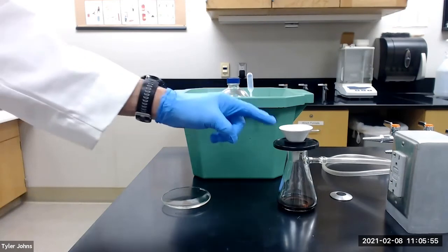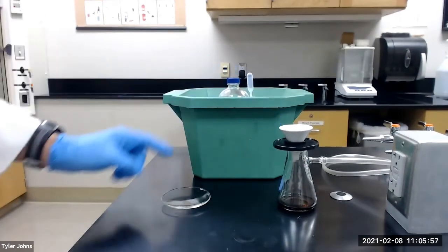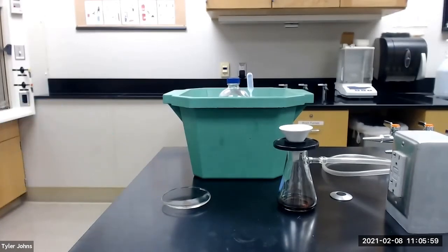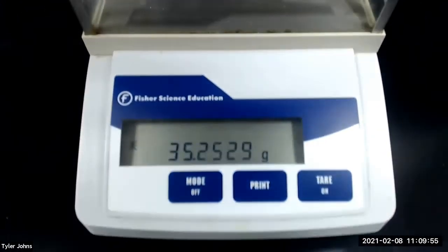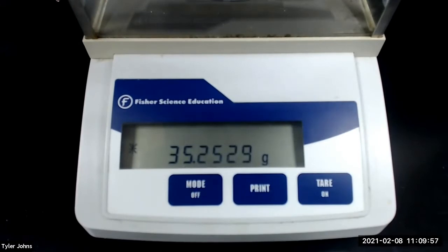While our crystals continue to dry, we will next pre-weigh a watch glass. The mass of the pre-weighed watch glass is 35.2529 grams.